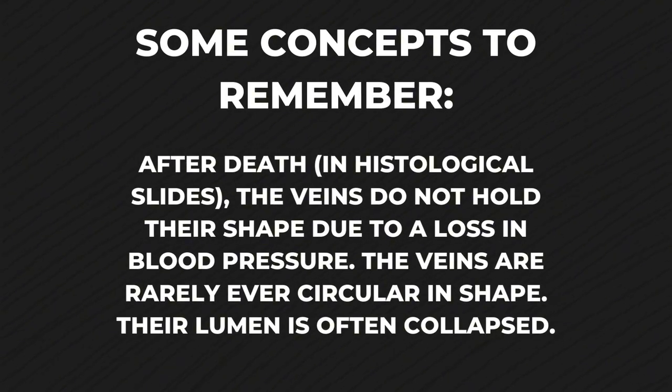After death, the veins do not hold their shape due to a loss in blood pressure. The veins are rarely ever circular in shape. Their lumens are often collapsed.